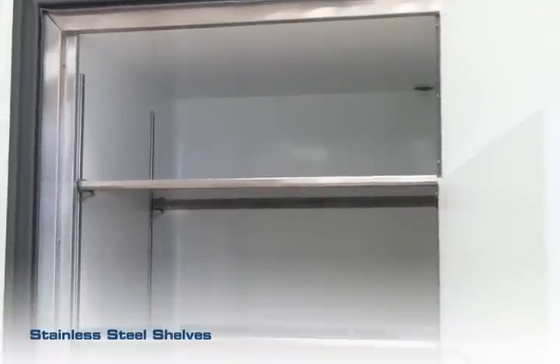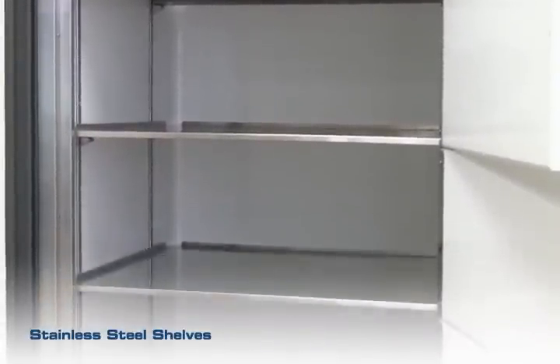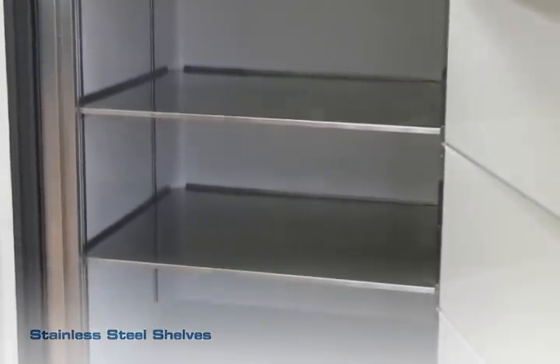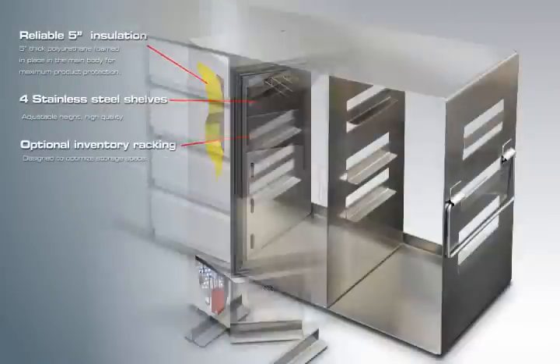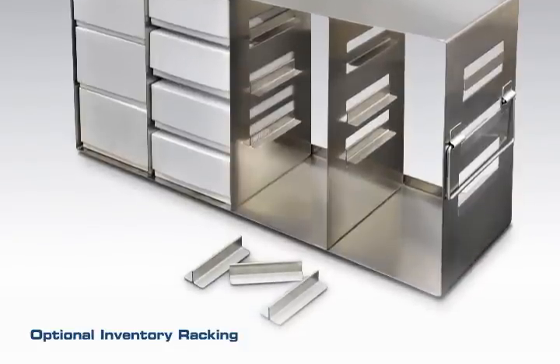High-quality stainless steel shelves with adjustable height are provided with the unit. Optional inventory racking with adjustable side access rack is included to accommodate both 2-inch and 3-inch boxes.